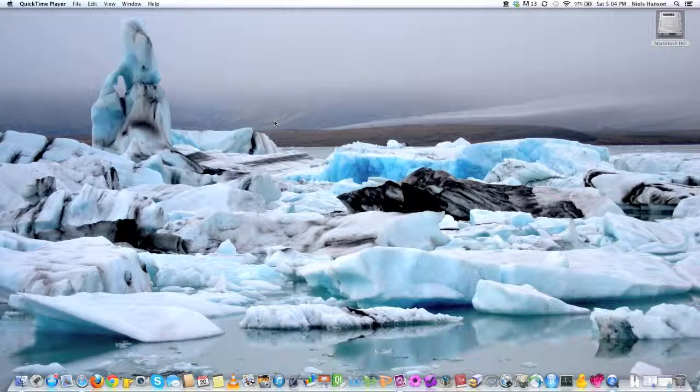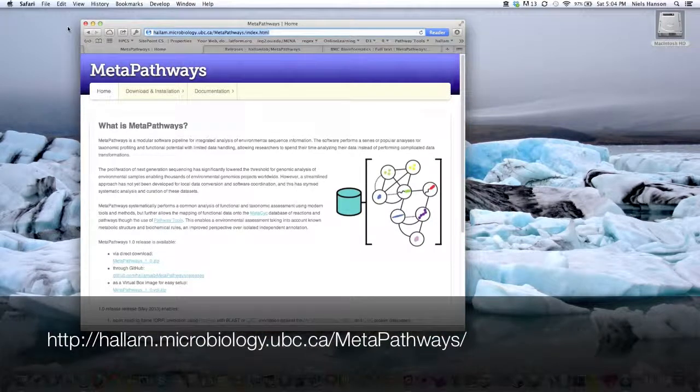And today I'm just going to direct you, in this series of videos, through how to install and get the pipeline running on your system. So the first thing you're going to have to do is obtain the pipeline, and you do that by downloading it from one of the available websites.